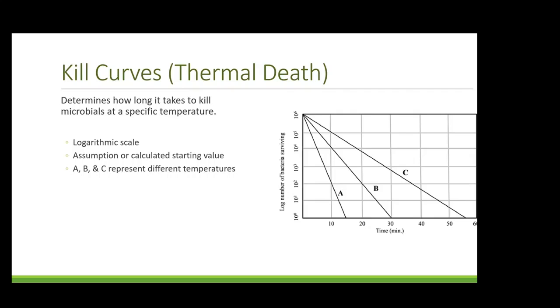The standard temperature for autoclaves is 121 degrees Celsius or 250 degrees Fahrenheit, though the temperature could also be higher for shorter sterilization times. The graph shown here is just an example of what one of these curves could look like.